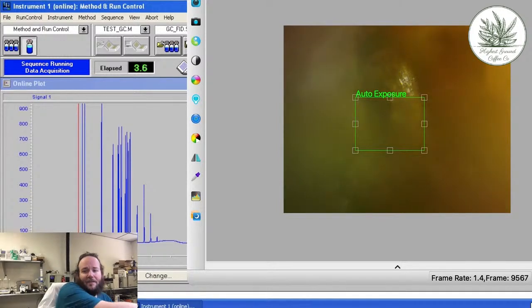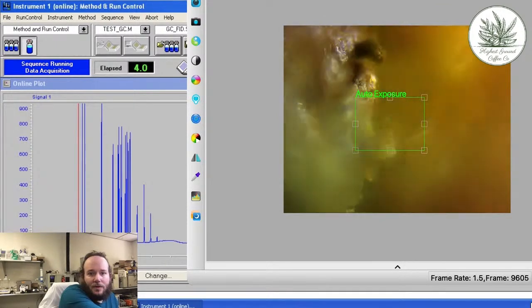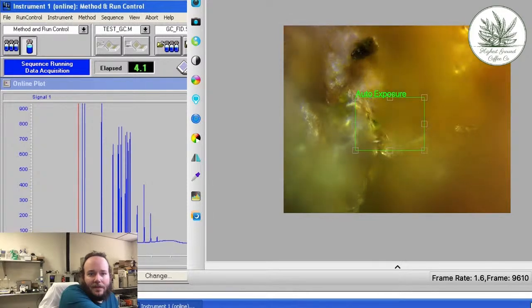By the way, if you're watching this and you're wondering why sometimes it slides on the microscope lens, there's an objective and it can move up and down, and that way you can press against what you're looking at. And as you rotate in and out, as I'm doing right now, oh, good grief. Looking at something over here.